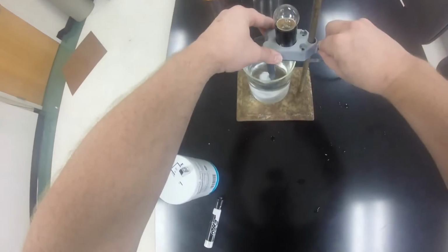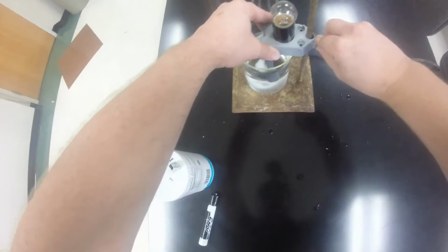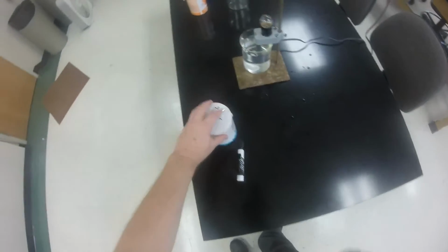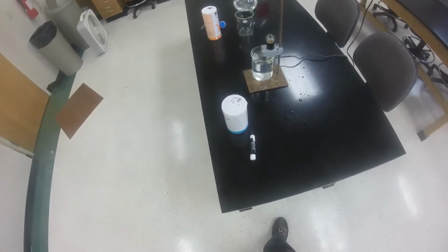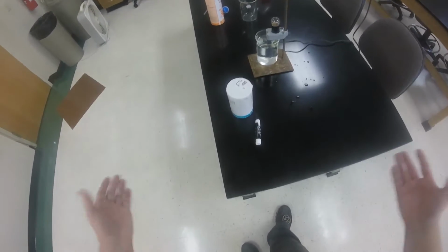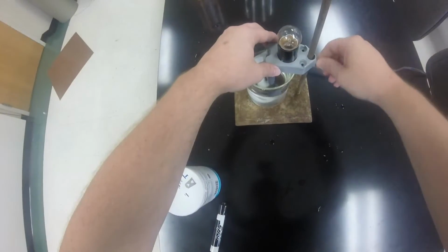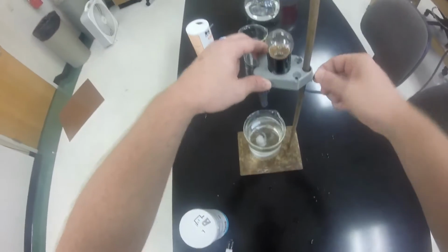Okay, so we're going to lower it down. There we go. See, we've added sugar and our bulb is still out. We don't see any light coming through it. So that is our non-electrolyte. There's no carriers. The sugar doesn't break apart, so it can't carry any of the voltage.